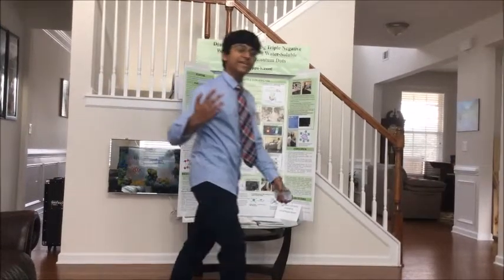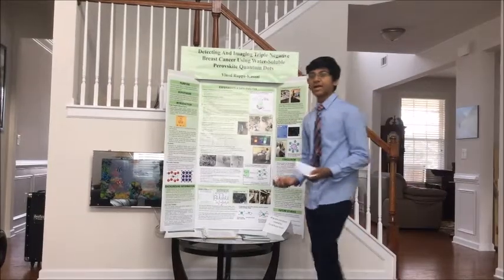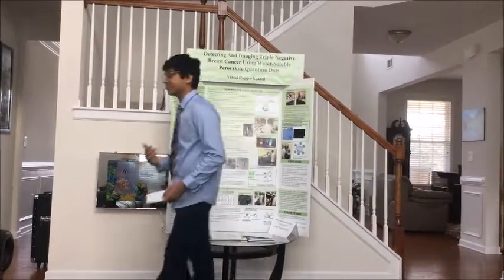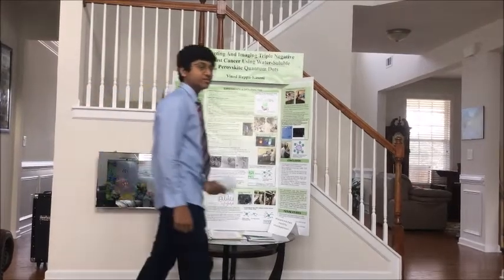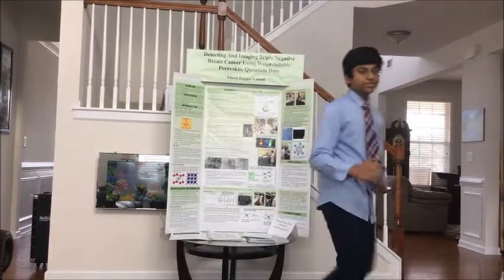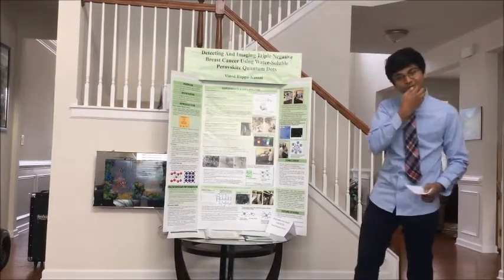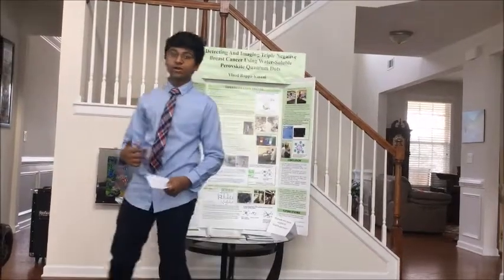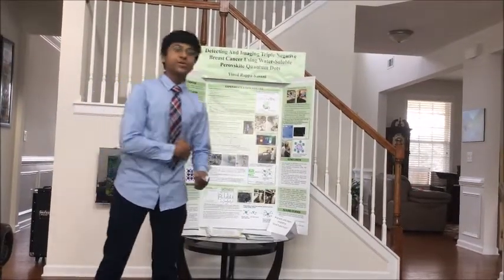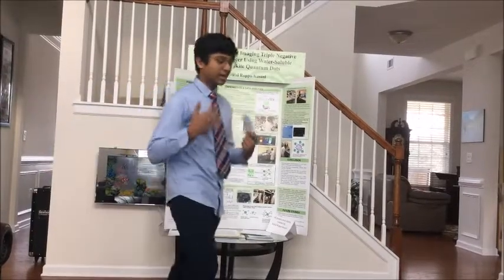So now I'll be getting into my procedure. The procedure goes as follows. I had a cesium oleate precursor solution, which I made using cesium carbonate, oleic acid, and 1-octadecene. This is heated and mixed under nitrogen gas and mixed with lead bromide, oleylamine, and 1-octadecene. The lead bromide is only for the green luminescent perovskite quantum dots, but for red and blue, there are different kinds of ratios of lead bromide, lead chloride, and lead iodide you can use.